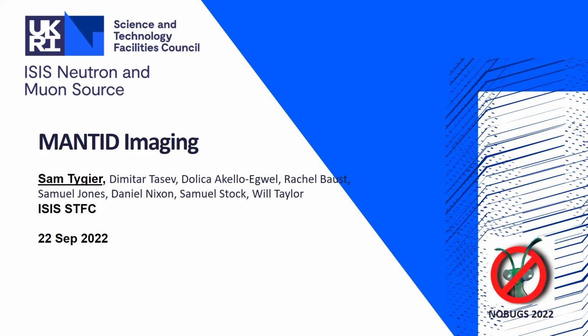Thank you. So yeah, some of you might recognize me from earlier, but now I'm going to talk about my sort of actual work, which is on MANTID imaging. So this is a project at ISIS, sort of related to the MANTID project, but it's a separate code base. And I've listed the developers within the team, some current, some previous, and a few of them are in the room here somewhere. Hello.